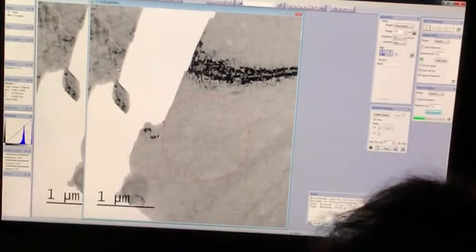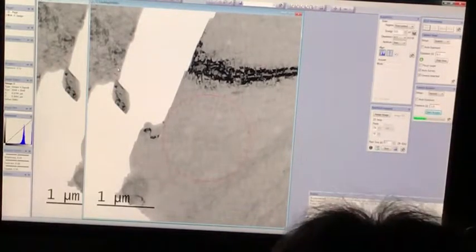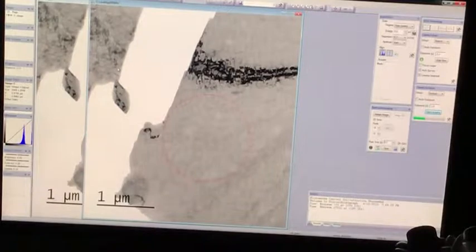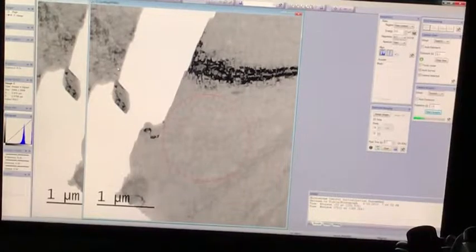So the next thing to do is we want to get some better idea of what these lined features are. We want to see if we can improve our resolution of them. And so I'm going to see what orientation we're at. So I'm going to image the diffraction pattern, but not on the detector, because when you form a diffraction pattern you have all the intensity going into one particular point, which means that you're going to burn the detector. So I'm going to lower the viewing screen.